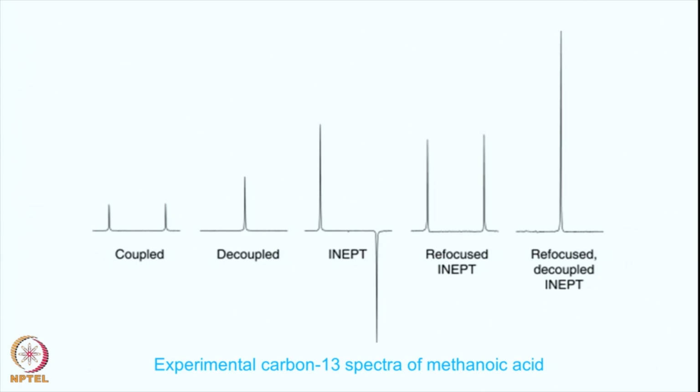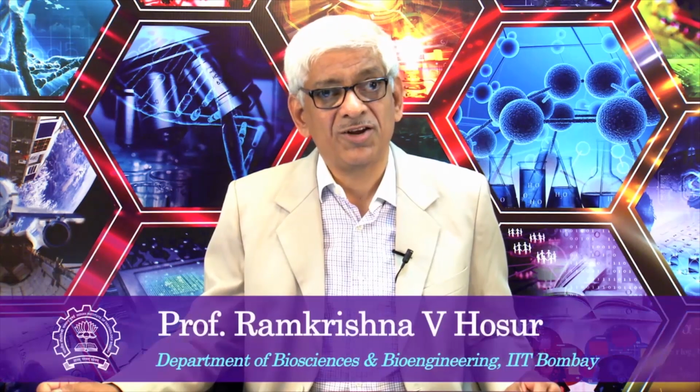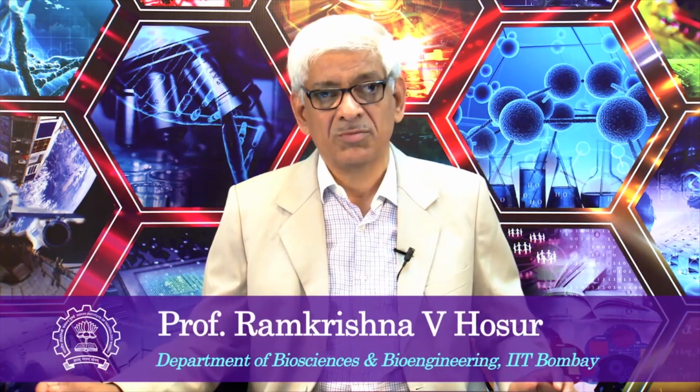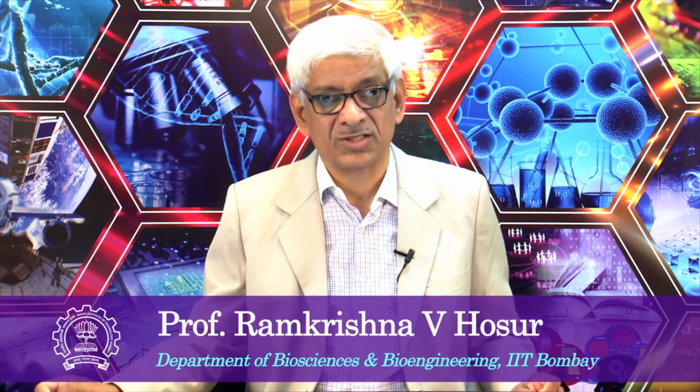For all organic chemistry people, this has become an extremely useful technique for determining how many carbons there are in their molecules, how to get signal to noise, and you can do it with natural abundance. You can do carbon 13 spectra at natural abundance. You use proton magnetization to enhance the signal to noise ratio, and you can identify the number of carbons in your molecule, and if you record proton coupled spectra also, then of course you can see the multiplet structures and all of those things. So I think I will stop here.